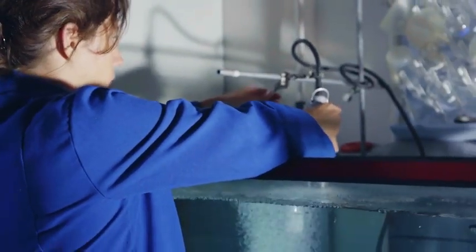All my research is about testing instrumentation in the field. Especially in my case, I'm working with ammonium sensors from Horiba, so everything is related to the technology of the sensor and how they work and how they were built.